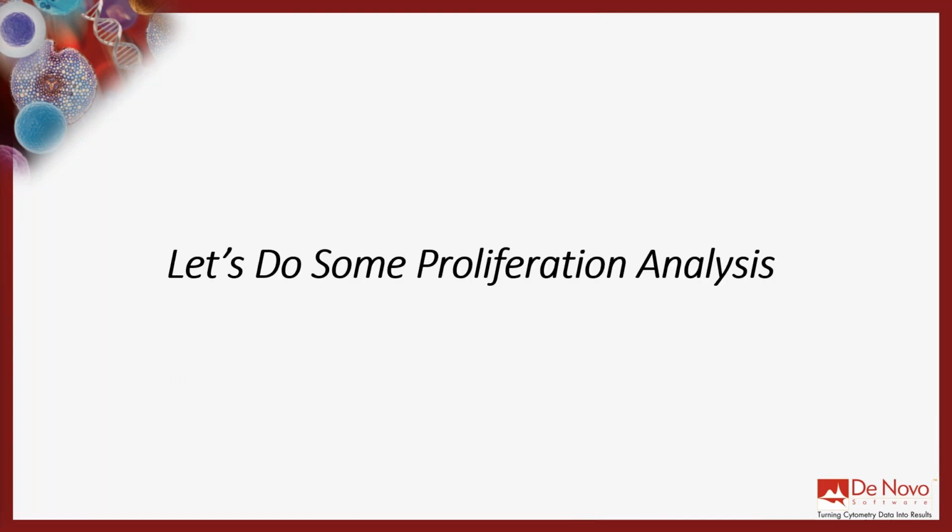All right. So let's do a proliferation analysis. So before I do that, I just want to talk a little bit about what I'm not going to do. So this is strictly on proliferation. I'm not going to really get into all the different features within FCS Express. It's not kind of a getting started thing where I'm going to show you all these different things of how to do multiple plots and stuff.